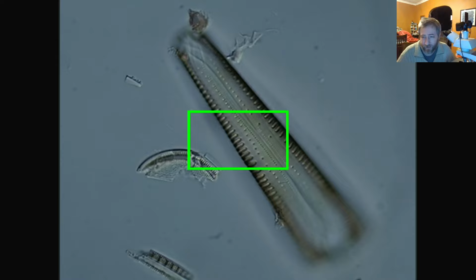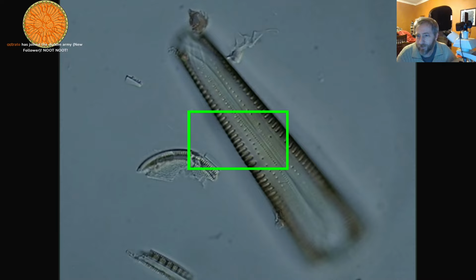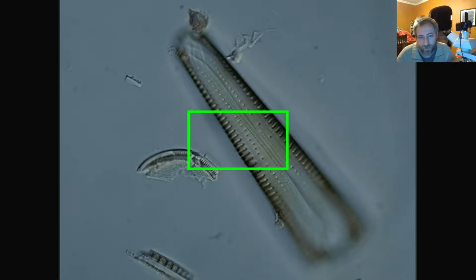So, oh, to remove the green box. Oh yeah, I see what you're saying. I don't remember what it is. There's probably a way to do it. You've got the green box. It's not actually the autofocus box. It's the zoom box. It's going to show me exactly what we'll zoom into if I zoom in, right? So we get crazy and zoom way in with my camera using the power of digital technology. And then you can see that the striae are biseriate. It's just the zoom box. I'm sorry, it's annoying. If I just put it on the 1.5x, it wouldn't be nearly as annoying.